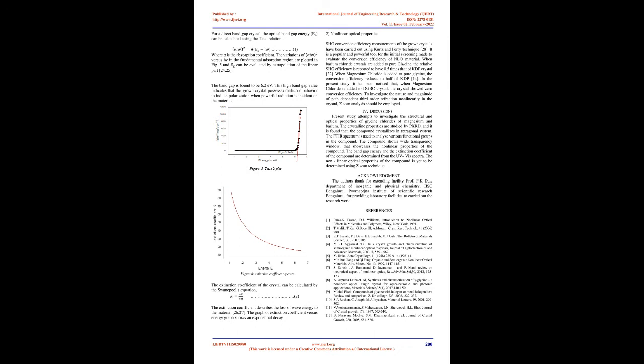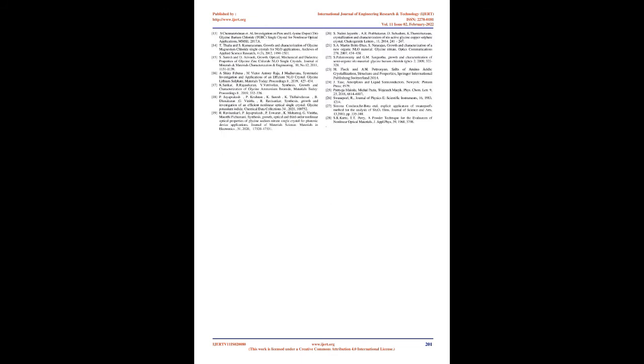If the maximum wavelength, i.e. the cutoff, lies within this region, the existence of a wide transparency window indicates a material of NLO properties, which finds applications in electronic industries. For the titled compound, the cutoff is found to be at 191 nm. This remarkably low absorption in the entire visible region makes the compound a suitable material for optoelectronic NLO window materials in optical instruments, second harmonic generation and parametric oscillations applications 10, 11.